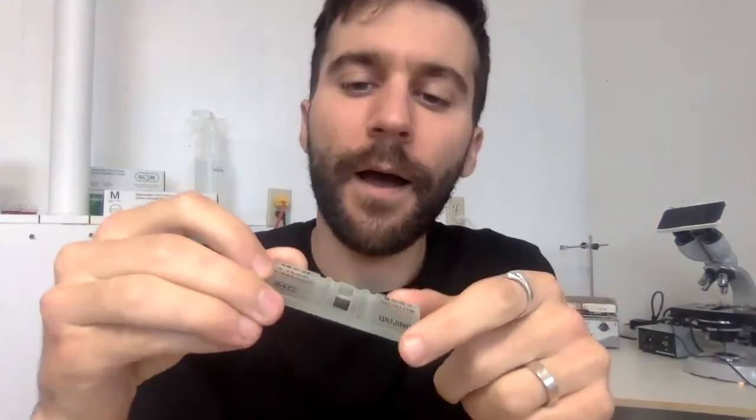We're going to take a sample of this and use that microscope back there and something called a hemocytometer. Hemo, blood, cyto, cell, meter, count. It's this, and we'll look at it under the microscope in a minute. We plate a small volume on here, and there are grid lines. We'll see that under the microscope, and we use that to manually count the number of cells.